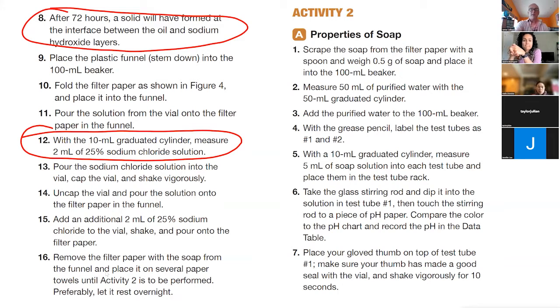The sodium chloride will help do that, because basically what you're doing is replacing the hydroxide ions with chloride ions. Hydroxide ions, bad. Chloride ions, not so bad. And then you'll filter it and wash it a couple of times.